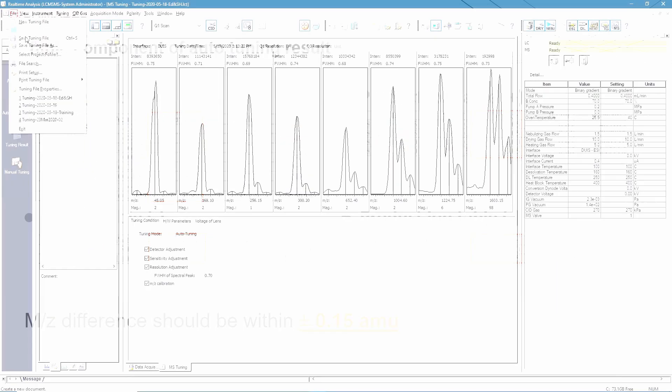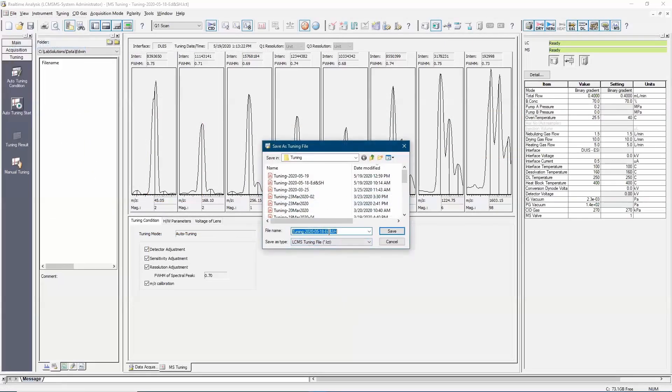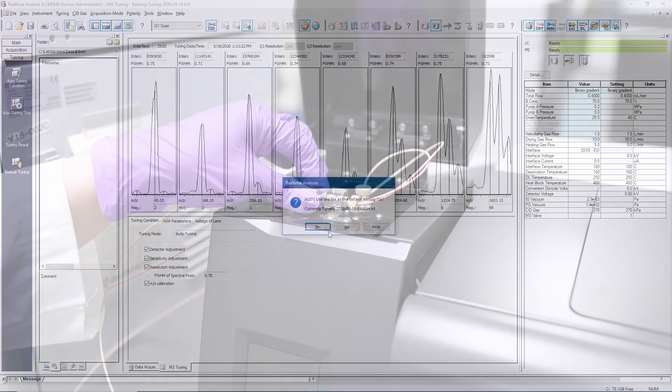Once the auto-tuning result is okay, save the tuning file and use it as the new default tuning file. This file will be used for the next auto-tuning maintenance.